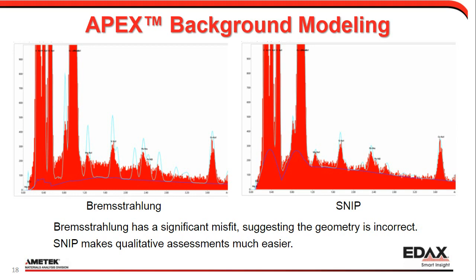But if you see a significant misfit in the background and you have to do a lot of fits to make the background look nice, that's usually an indication you shouldn't trust the quant results with particularly high precision. But again, it depends on what you're trying to do and what level of precision you are looking for in the quantification.